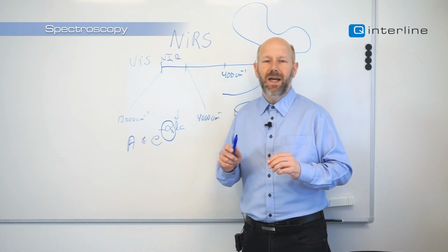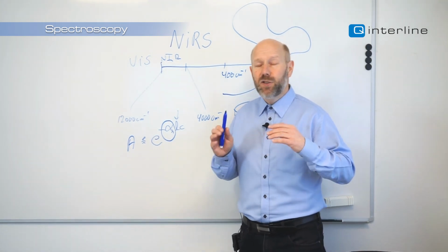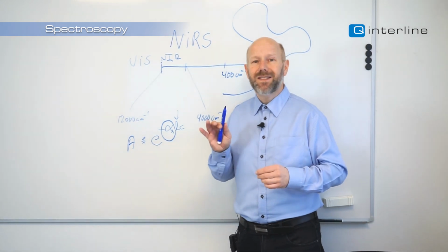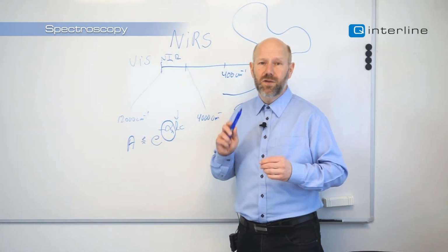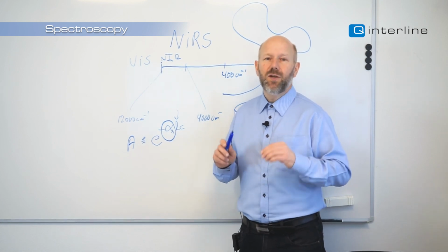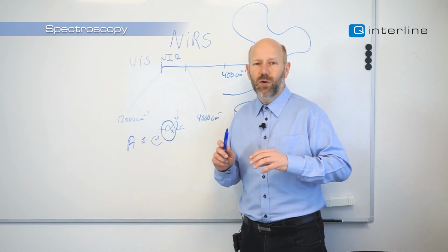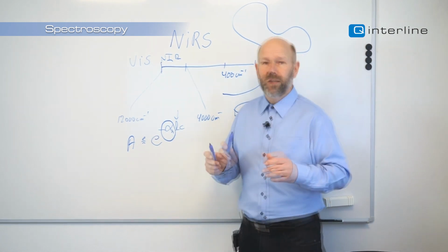And in general, in an NIR spectrum based on reflectance, the majority of the information stems from the surface. A good thing to bear in mind when you plan your sampling. Do not ask what's in the middle of the apple if you only look at the surface.